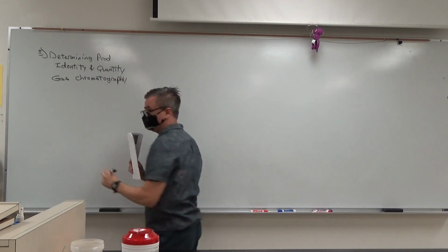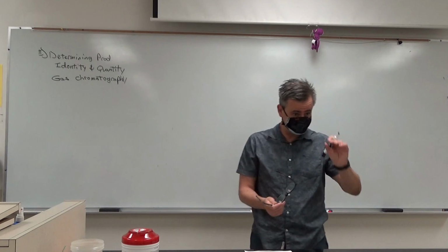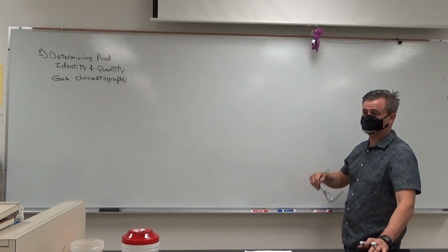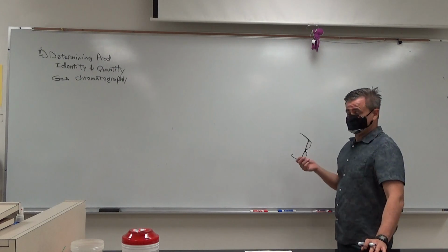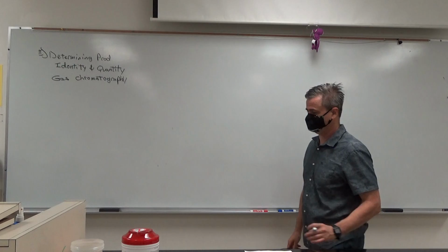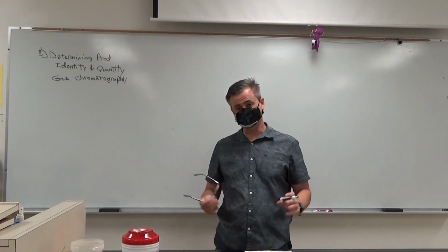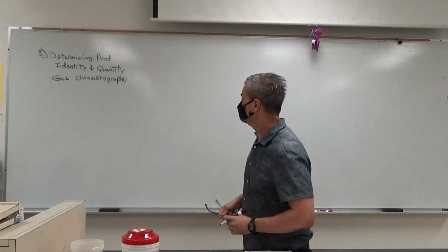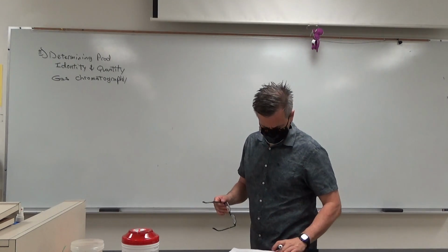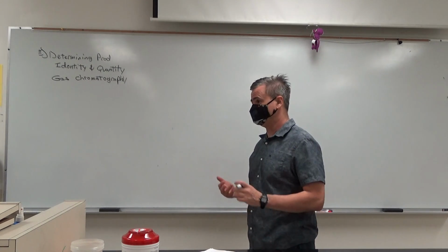Remember, anytime you invoke the word chromatography, that's separating mixtures, and that's what you guys have. You have a mixture. I gave you some expected, some unexpected, and there's probably some unexpected unexpecteds. So you need to separate those out and try to pinpoint, at least some of them, what's in them. All right. I'm going to draw a schematic of how a GC works.